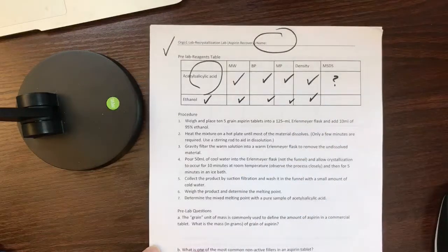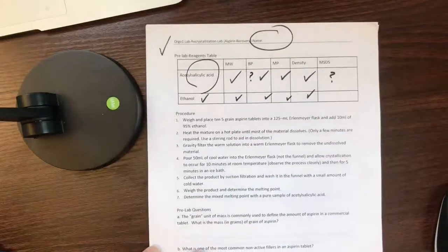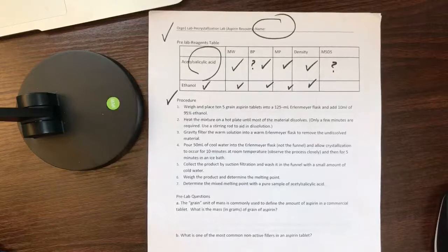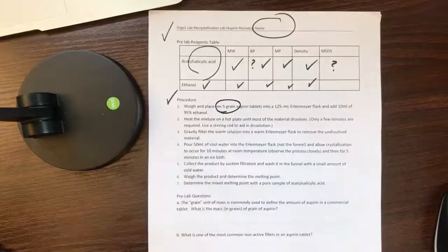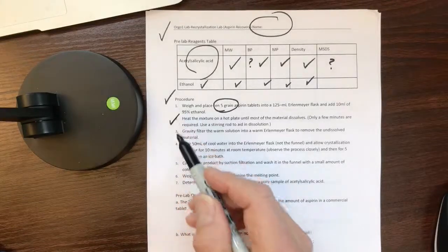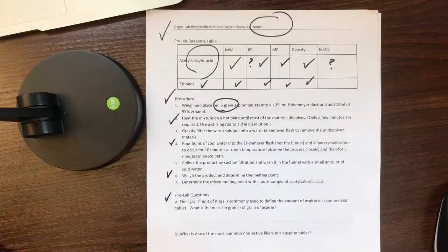By the way, pay attention to the boiling point of aspirin when you see it in the literature. I'm looking for that. Then we also have a procedure, which is basically what we're going to do. We're going to take the aspirin. We call it grain. It's not the metric system, it's a medical term, so we're going to ask you later on what the grain is. We heat the mixture, and so on. I have a little picture of that for us to look at.